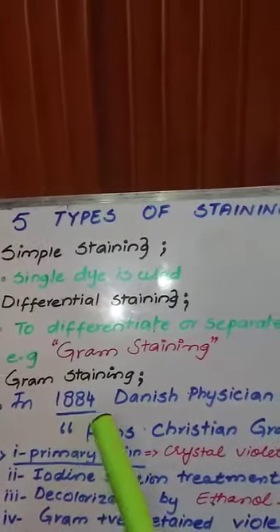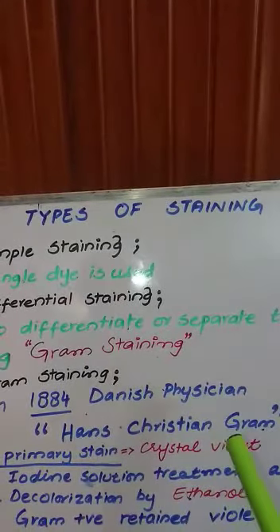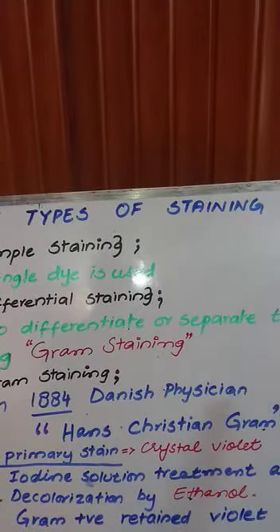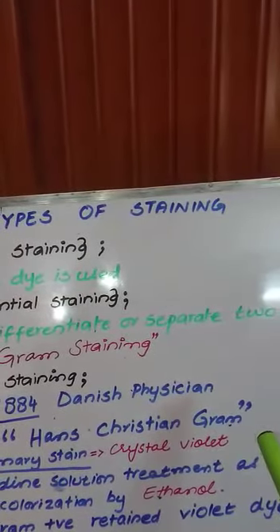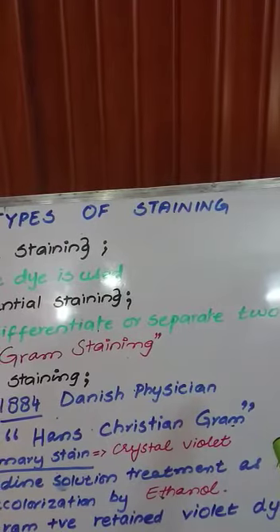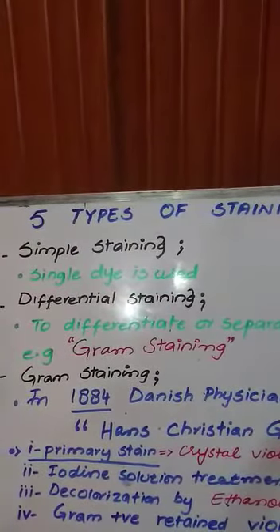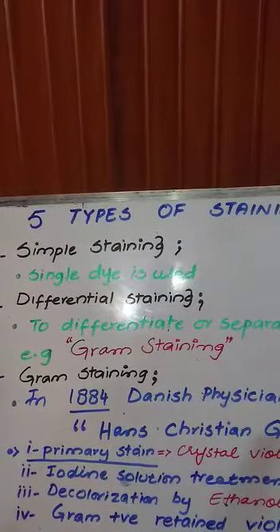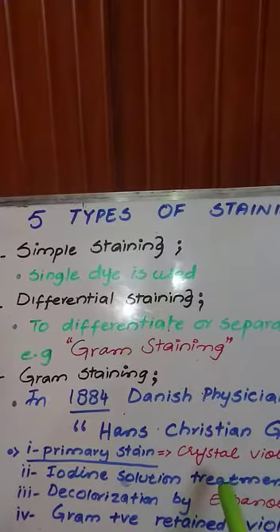In 1884, a Danish physician, Hans Christian Gram, introduced the technique while he was working with the staining of bacteria. There are certain steps in this technique.